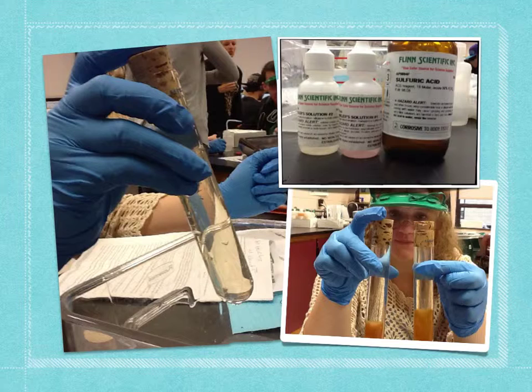Step 4. 6 to 7 drops of the concentrated sulfuric acid were added, and the stoppers were replaced on the test tubes. Both samples were inverted to mix. The brown precipitate dissolved and turned into a clear amber solution. Step 5. We then poured 20 milliliters of the treated water from the test tube into a flask.